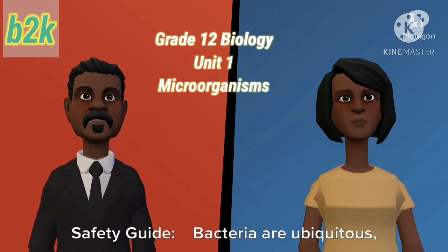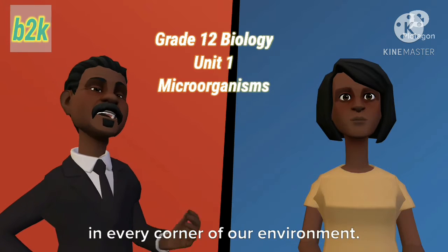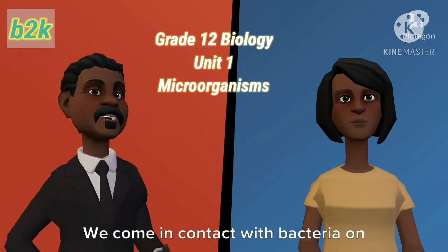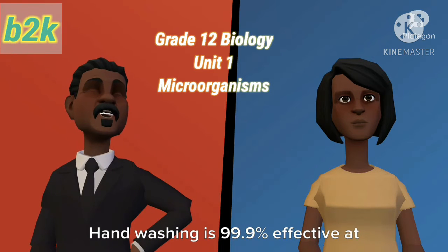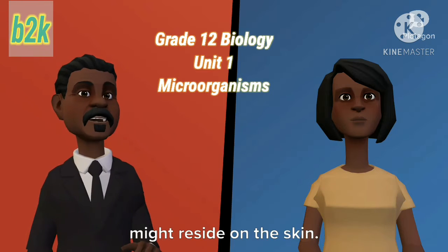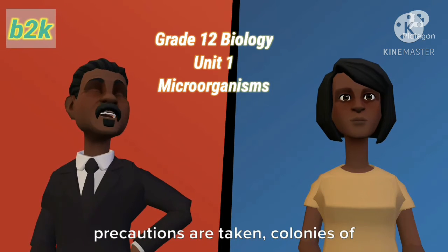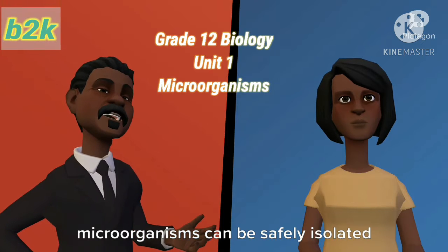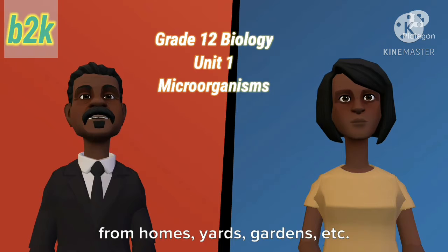Microorganisms Safety Guide. Bacteria are ubiquitous, and live within the human gut, and in every corner of our environment. We come in contact with bacteria on a daily basis. Hand washing is 99.9% effective at decontaminating us from bacteria that might reside on the skin. Therefore, when the proper safety precautions are taken, colonies of microorganisms can be safely isolated from homes, yards, gardens, etc.